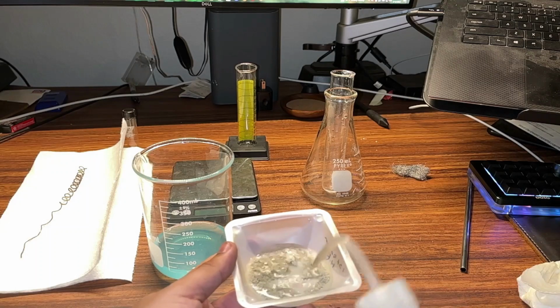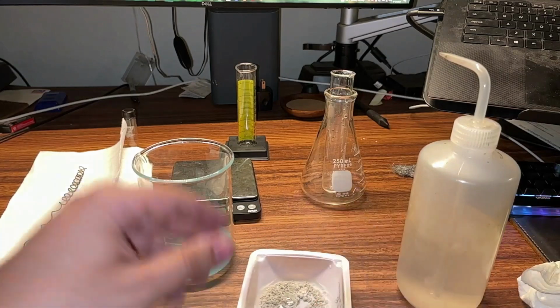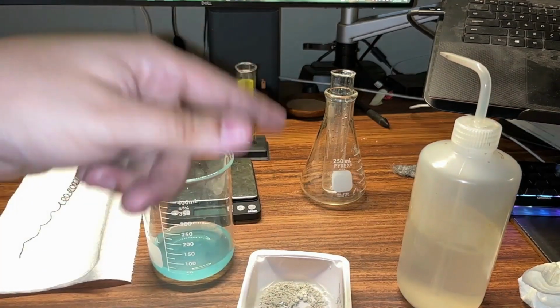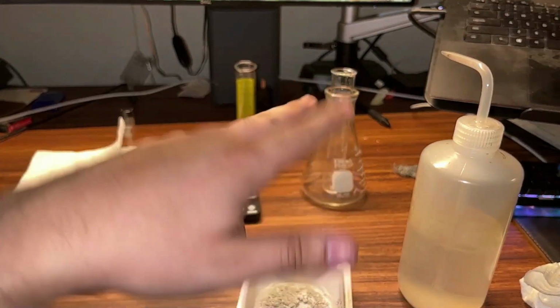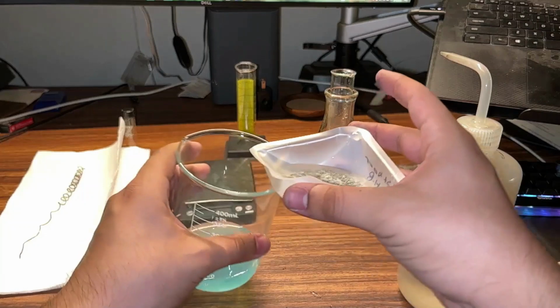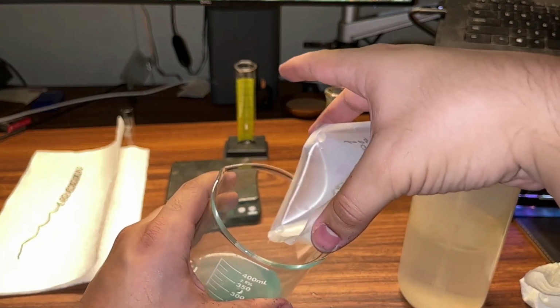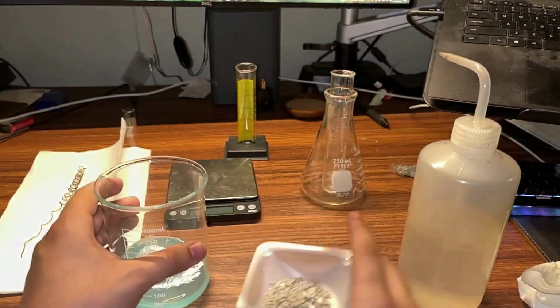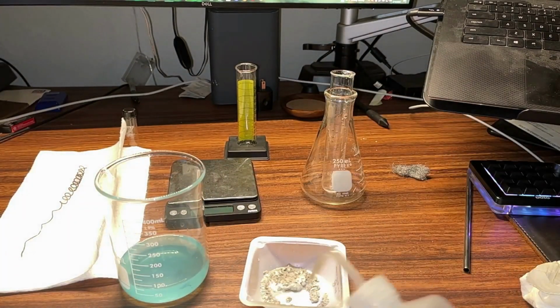And then if I let it sit for a second, the silver floats to the bottom, and the impurities stay in the water. So when I pour the water out, it takes the impurities with it. That's the idea here. So the more times you rinse, the purer your product is going to be.